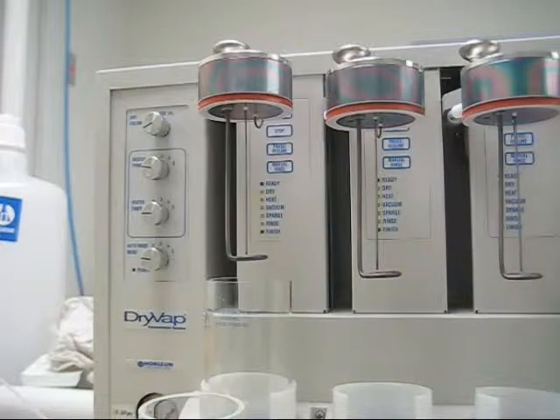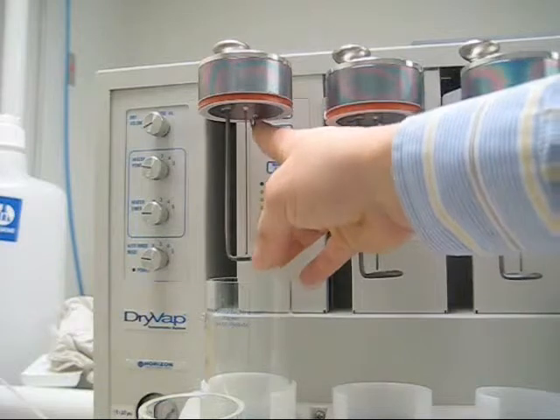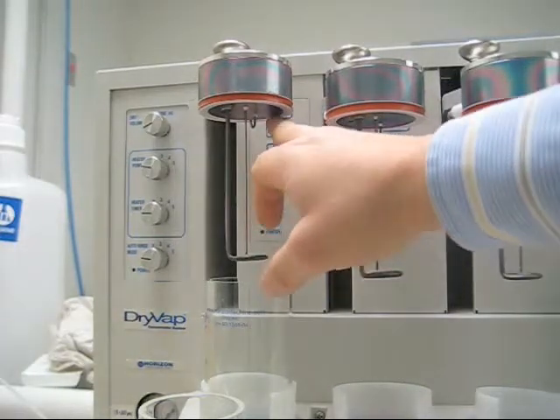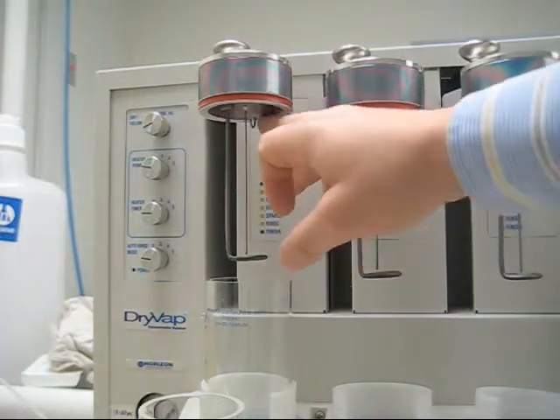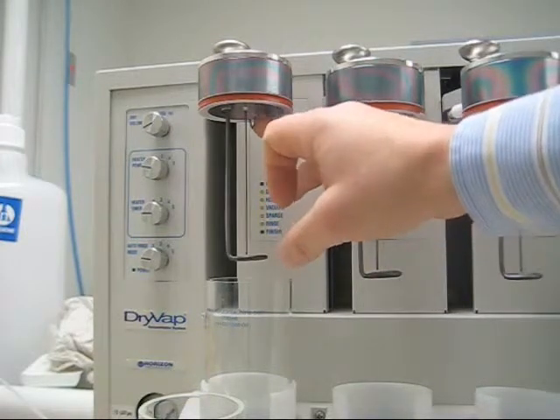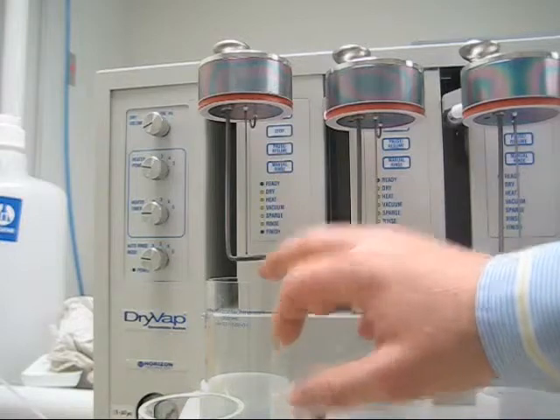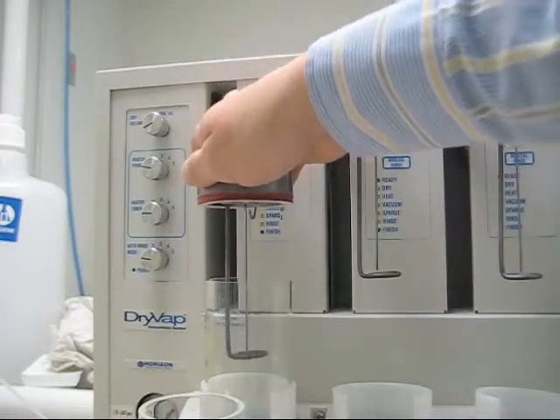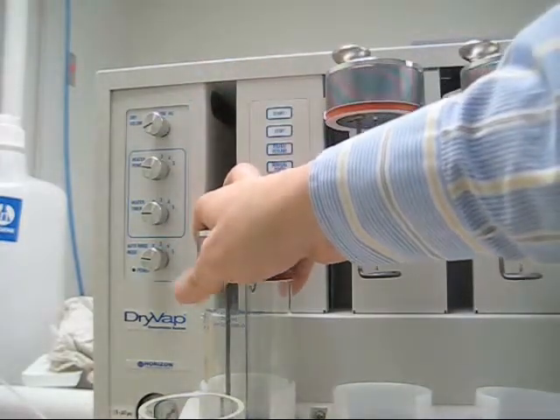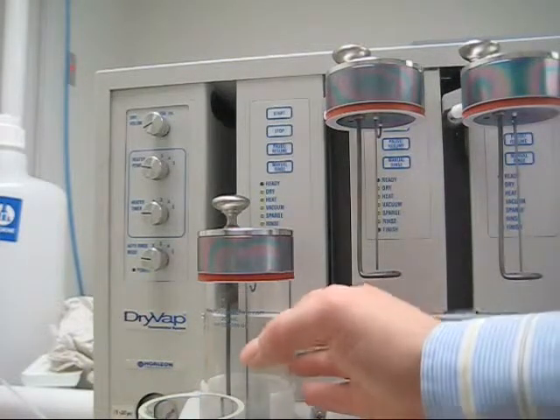If you take a look inside here, there's actually a rinse tube. The inside of this lid here is hemispherical, so when this rinse rod — it's just got a J-shape hook to it — it actually sprays onto the top here, giving a good coating action of the glass itself. This actually just lowers right down into the glass and a vacuum is formed onto that concentrator tube right here.